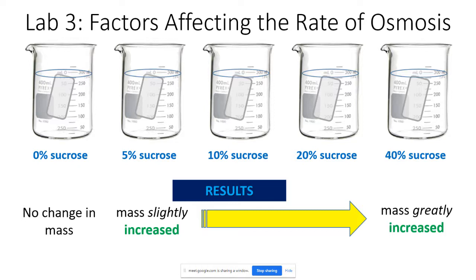And instead, in your lab groups, you're going to discuss just the analysis questions that you can do based on the theory of osmosis and what you think this is doing to the rate of osmosis. Keep in mind that these bags have all been placed into the beakers at exactly the same time and then removed from the beakers at exactly the same time. So there's no bag here that's spent longer. They've all had the exact same amount of time interacting with the water beakers.